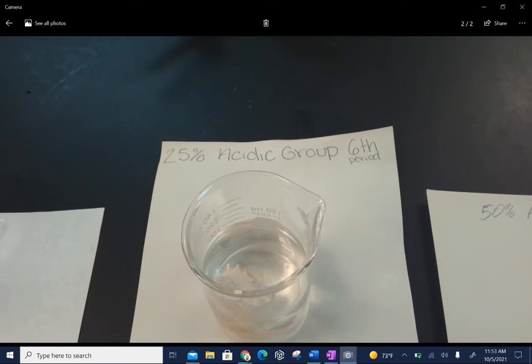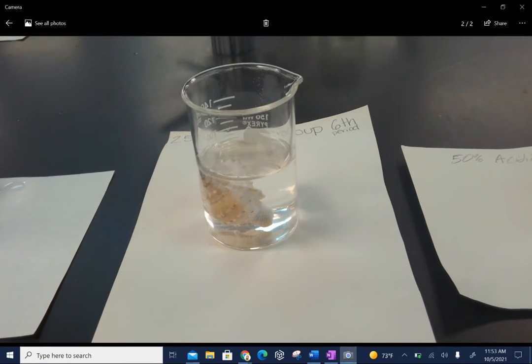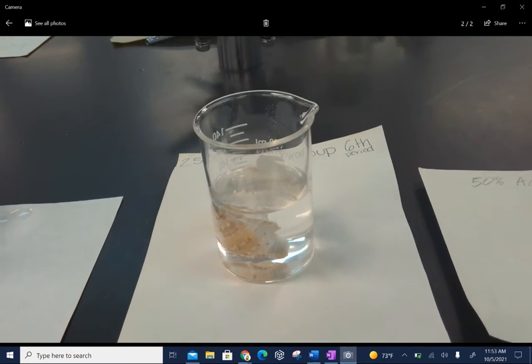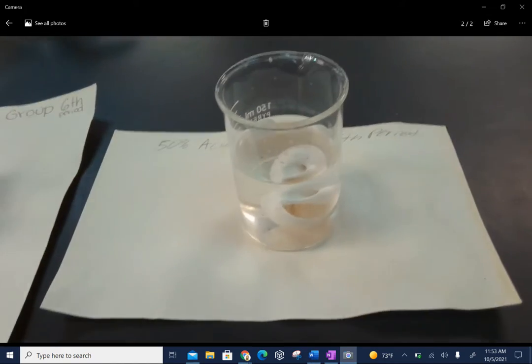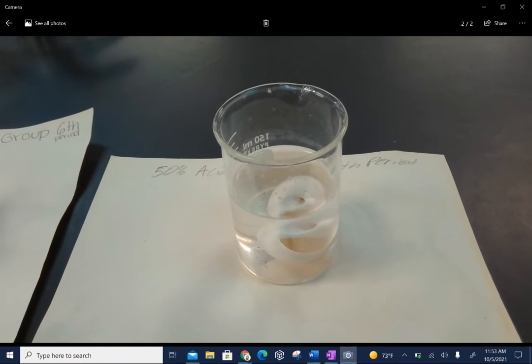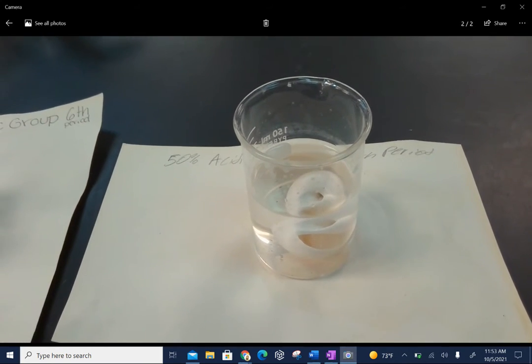Then we had another group. This one's labeled 25% acidic because we used 75 milliliters of salt water, but then added 25 milliliters of vinegar to represent acid that's forming in our oceans. And then we have our 50% acidic, where there are 50 milliliters of salt water added and 50 milliliters of vinegar added.